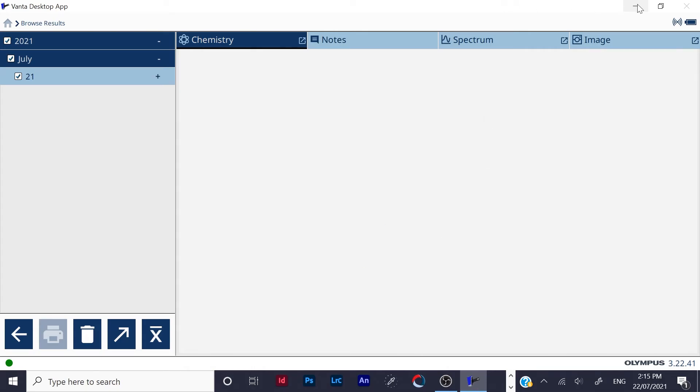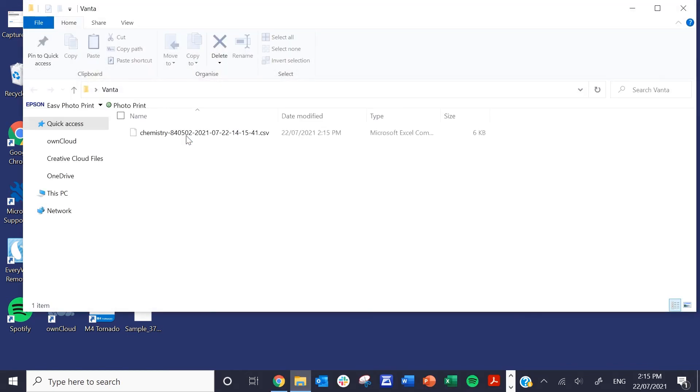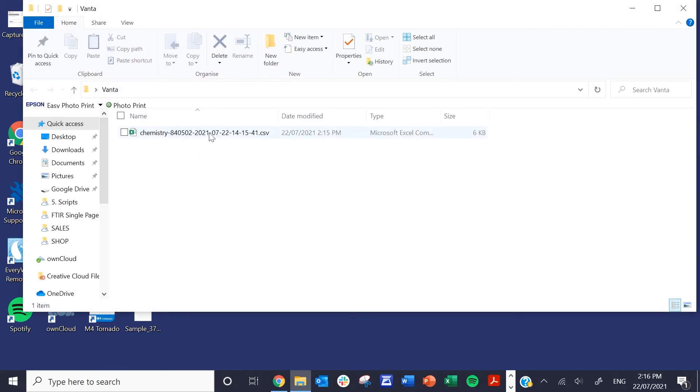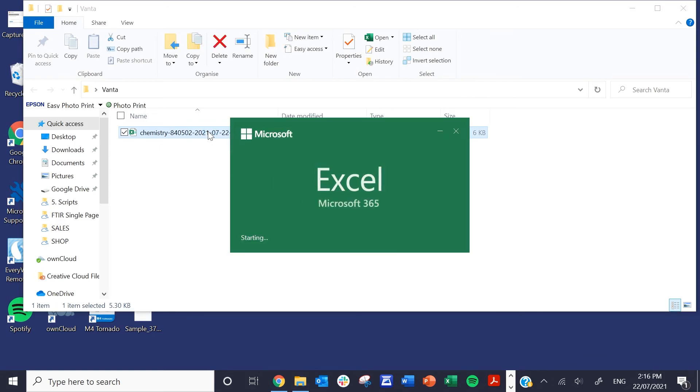So then you can check that it's worked. Just minimize the software, find it. There you go, there's your Vanta folder. Double click, open it, and there are your results, which should open up to an Excel spreadsheet.